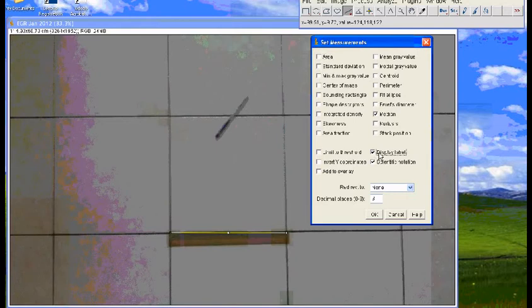We want to display label. And decimal places, let's use 4, no harm. Use 4 decimal places. Okay, and then third step, go to Analyze again. You want to have your first measurement. This is a result, just a clipboard to show you a result. So the first one, this line here is about 30 centimeter, 3.0, 4 decimal places, times 10 power 1.